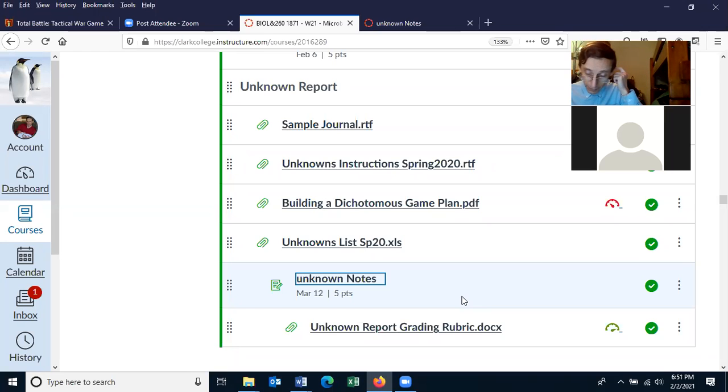And for the gram stain, remember, you have to have fresh growth, so you have to grow it out 2 days before you start on it. And you started it on Sunday, but you never looked at the slide until Monday or Tuesday, and you got your results on Tuesday. And then you're starting the lactose fermentation test on Monday, and that one ideally should run from 18 hours to at most 48 hours. Okay? And that's why you're starting that one on Monday. And then you'll get the results on Tuesday for all 3 of those tests.